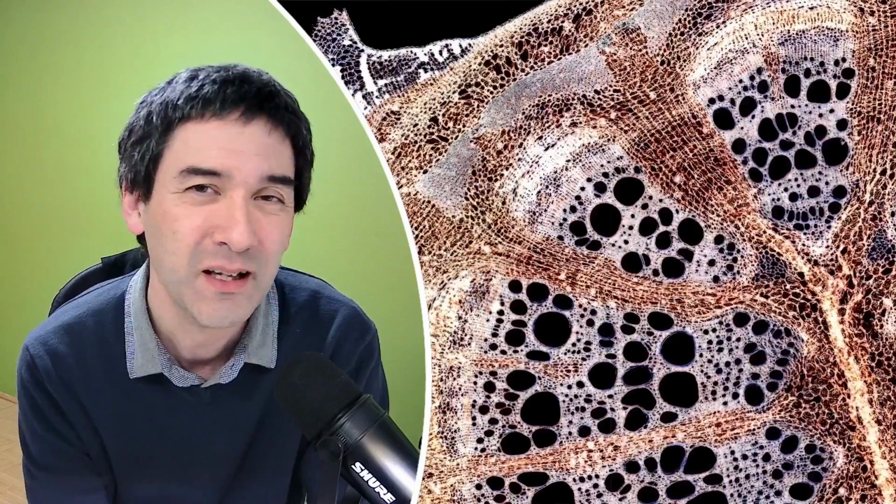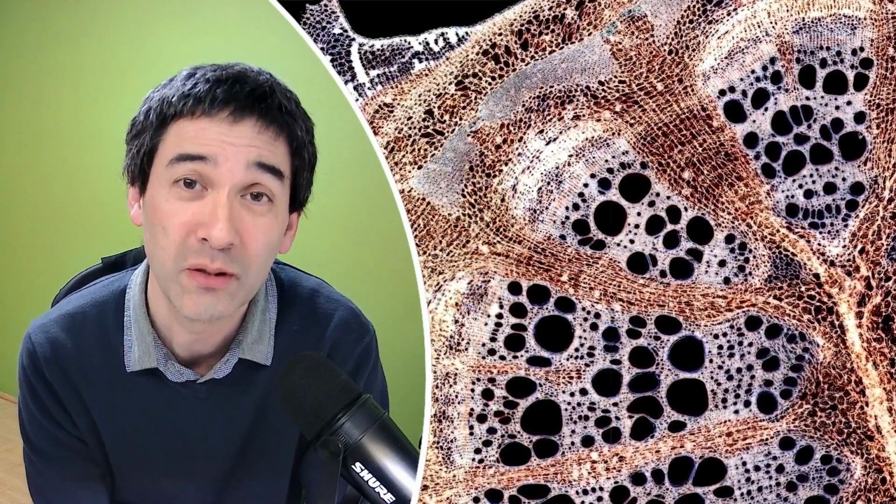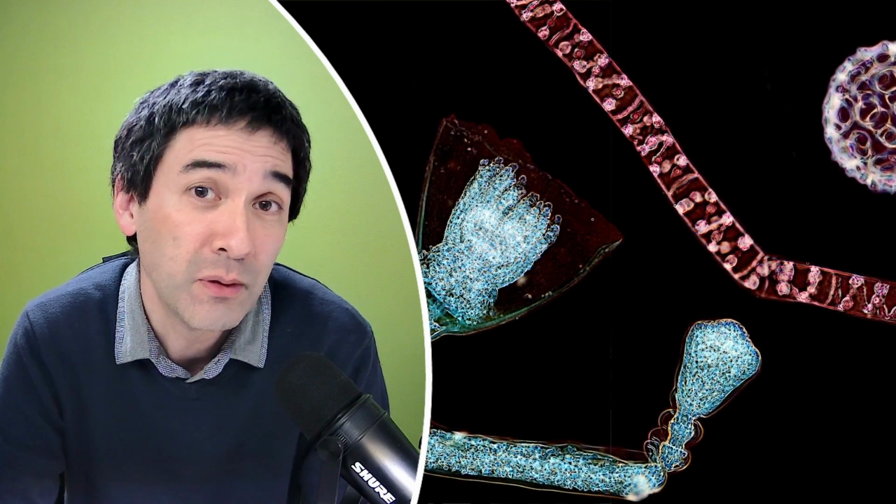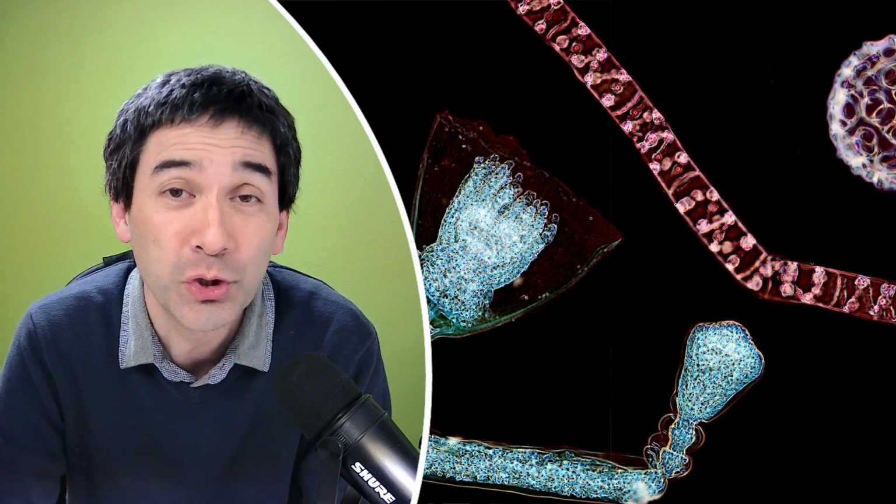the water, and essentially 100 degrees is not enough to completely sterilize certain microorganisms, because some microorganisms are able to form so-called endospores or spores, and these spores can be highly temperature resistant. So if you want to really make sure that all of the bacteria and their spores are killed off, you have to go up to, let's say, 120 degrees centigrade, maybe for approximately half an hour, and then you can be fairly sure that pretty much everything's been killed off. Right, but 100 degrees alone is not going to kill off everything.